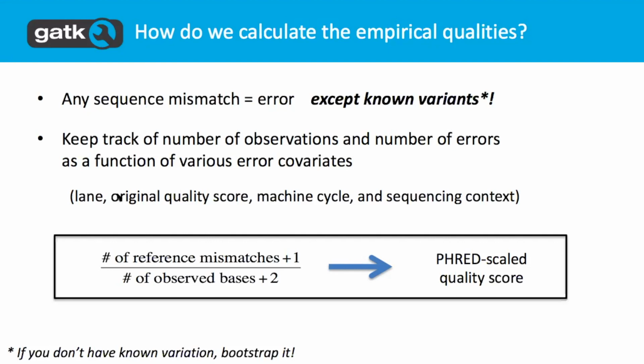Now the link that you can have is that there are some filters. GATK does some filtering on the quality of base calls. So if they're below a certain threshold, some bases will just be ignored. And that goes back to the question about trimming. Do you need to trim for quality? No, in part because we take the quality of bases into account. I forget what the exact threshold is, but let's say it's Q10: below Q10, you just ignore all of them.